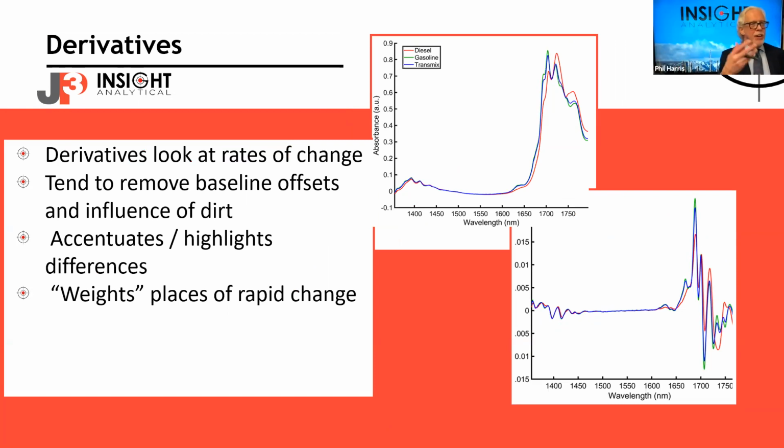We do a lot of things like, say, vapor pressure of condensate. One of the big applications in Canada is doing vapor pressure of natural gas condensates. When the model has been built around the lab method, ASTM D6377, we end up predicting close to the reproducibility and repeatability numbers of ASTM D6377.